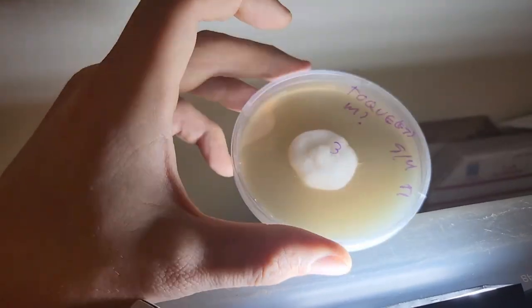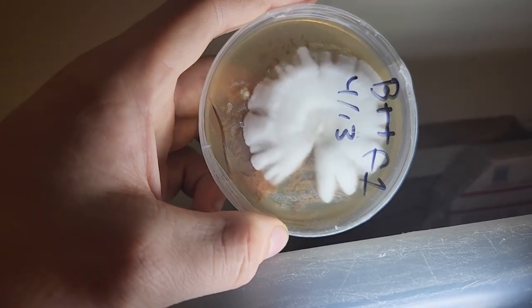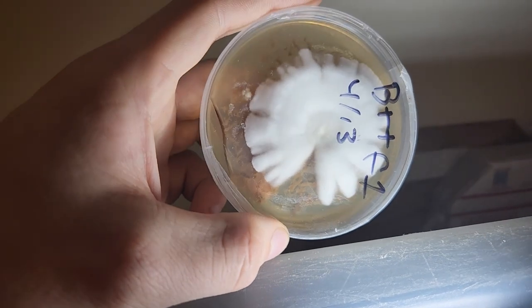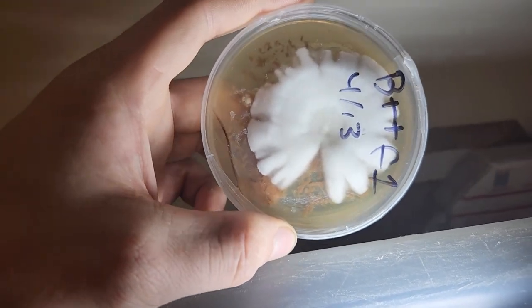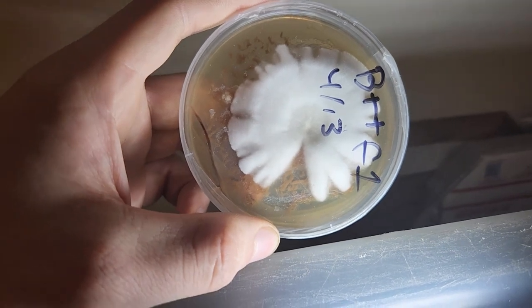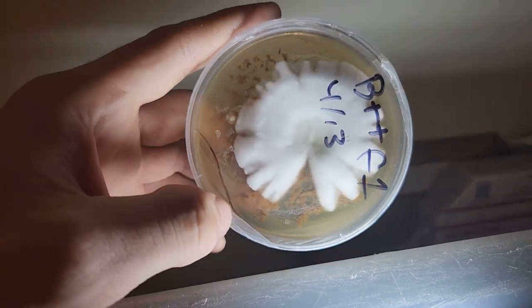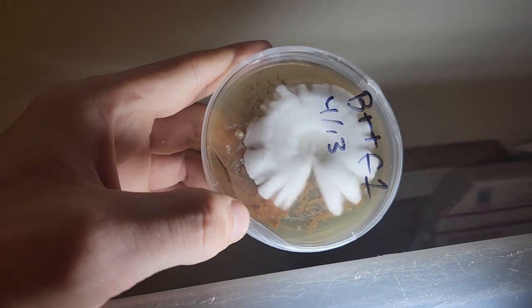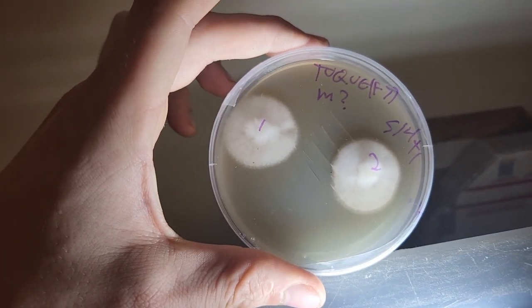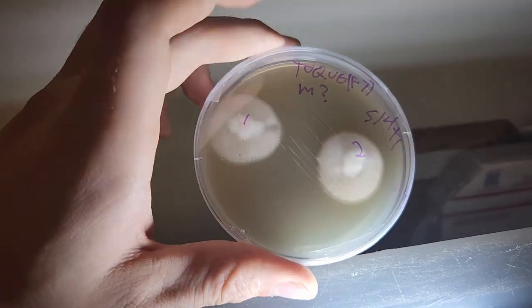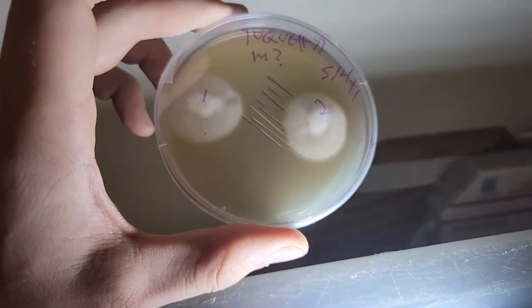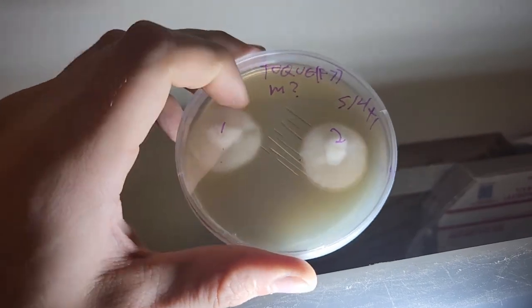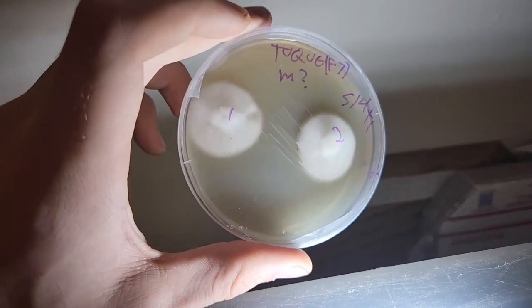It can grow in a few different ways as a monocaryon. Sometimes they grow out weird. This one may have made it in a few places, but the Pac-Man kind of mouth right there is pretty common from what I've seen. Another characteristic of monocaryotic growth is it's extremely slow. If you take a monocaryon at the same time you take a dikaryon, the dikaryon will probably fill up the plate maybe a week faster than the mono.